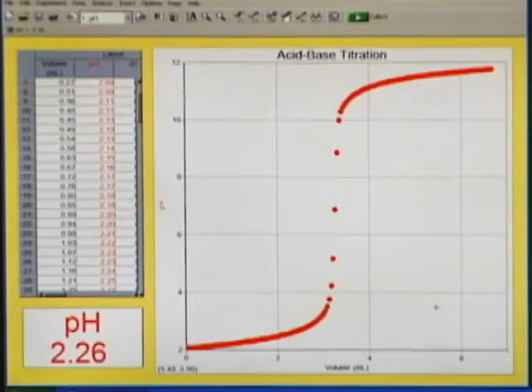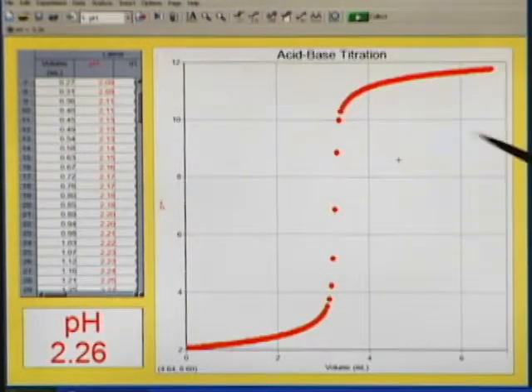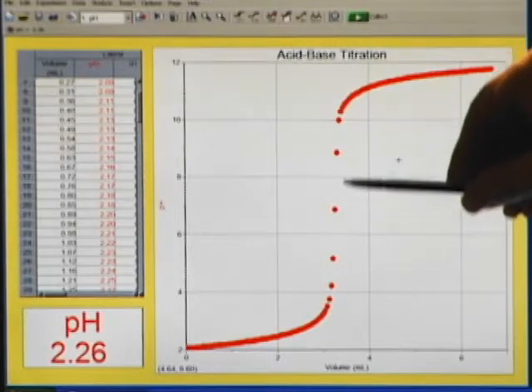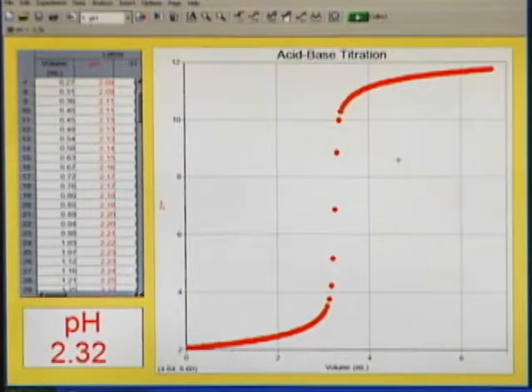So here's our completed titration data. We want to find the equivalence point of this, so if you look at this pH data, you can see that probably between these two drops is the largest jump in pH, but that doesn't give us a very accurate reading doing that.